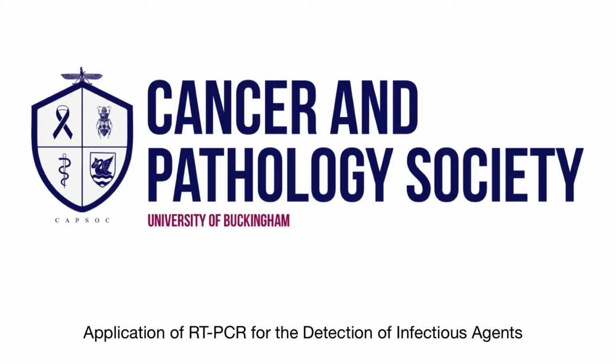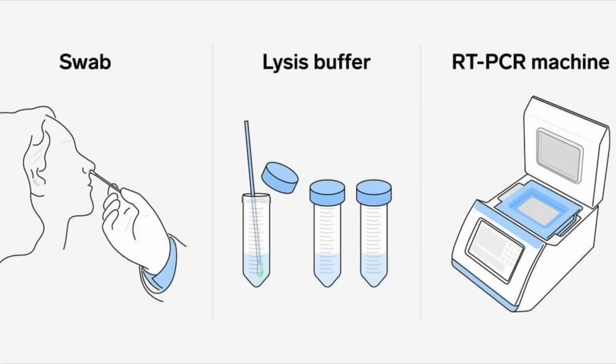In this video, we're going to look at how PCR and RT-PCR, which stands for reverse transcriptase PCR, are used to detect infectious diseases, in this case, SARS-CoV-2. A few basic notes before moving on to looking at these steps individually in more detail in the lab.